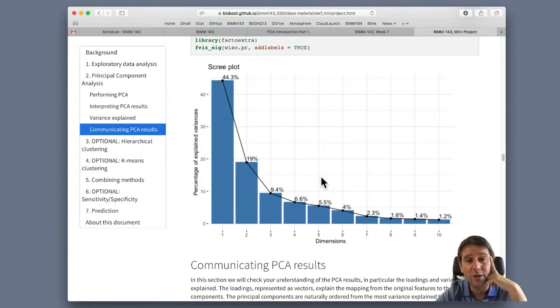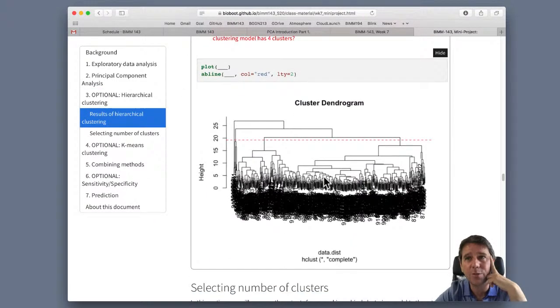It's really important at this stage, not that we understand the math necessarily, that we'll talk about in a second, but that we really understand the purpose of these things. What are they trying to get at? And we can, of course, always build up our knowledge of the behind the scenes as we go through. So please do explore that and have a go at it.